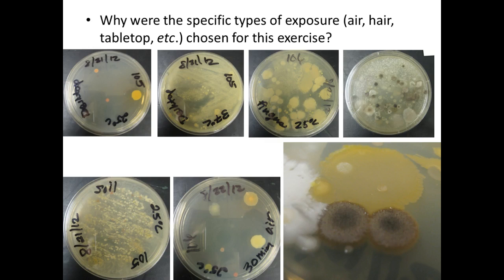So also, if we get any of those, I usually tape those plates shut. We don't want to open them up and release those spores. Anybody who has allergies like myself or sensitivities to mold spores, we don't want to expose people to that.